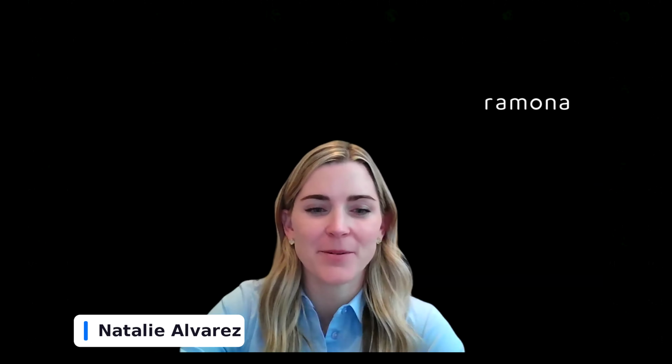Great. Thank you so much, Patrick, for that exciting presentation. And it's been a pleasure collaborating with both you and Franz. So now it's time for a quick pop quiz. I'd like to ask everyone about the throughput that Patrick saw on our Vireo system. How many cardiac organoids did he image within 1 minute on the Vireo? We'll give everyone about a minute to respond to this question.